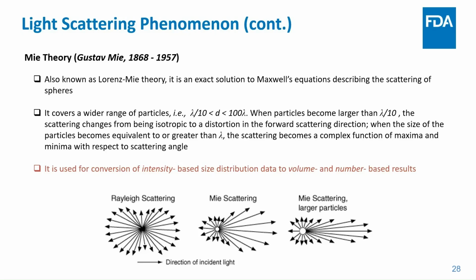So this is mostly dealing with the scattering as a function of scattering angle, especially when the size of the particles approaches the wavelength of the light or is slightly larger than the wavelength of the light. It's going to result in the scattering intensity at different measuring angles having different maxima and minima. So when you place a sensor at different locations, you will see some sensors have a higher amount, some sensors have a lower amount. You are able to construct a diffractogram, which is then used to calculate, through complicated equations, what is the original source of the particle resulting in the scattering pattern.